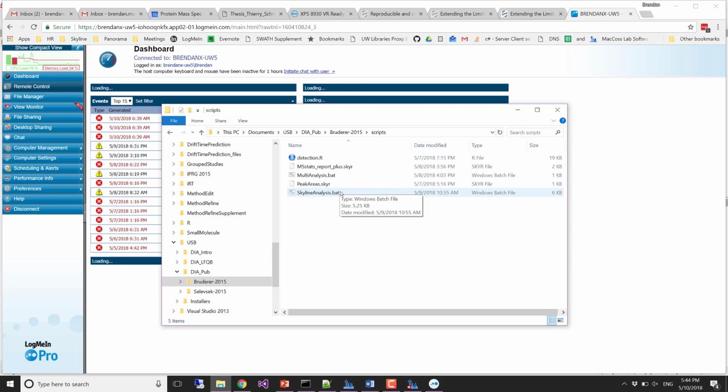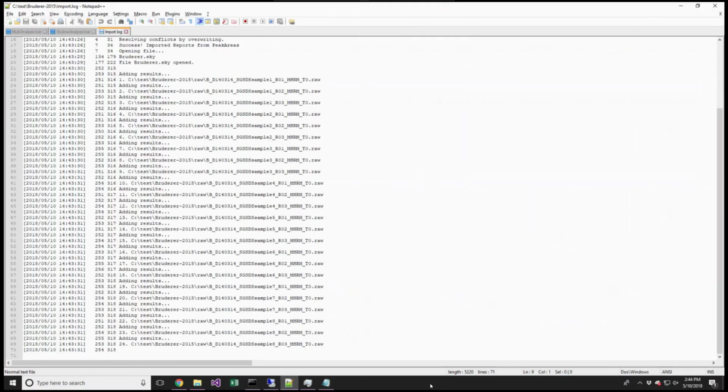And multi-analysis.bat, once you get it up, you can have a line per analysis, and you can just have it cycle and do a whole set. I mean, if you have the disk space for that, every analysis is consuming disk space. But anyway, you have that, and these are very handy. I've used these same scripts a lot, just tweaking them for different uses.